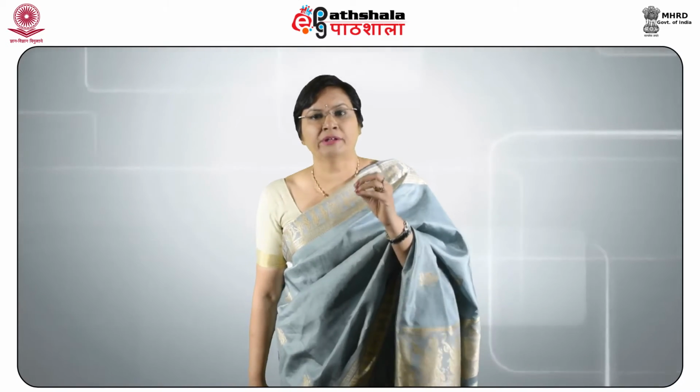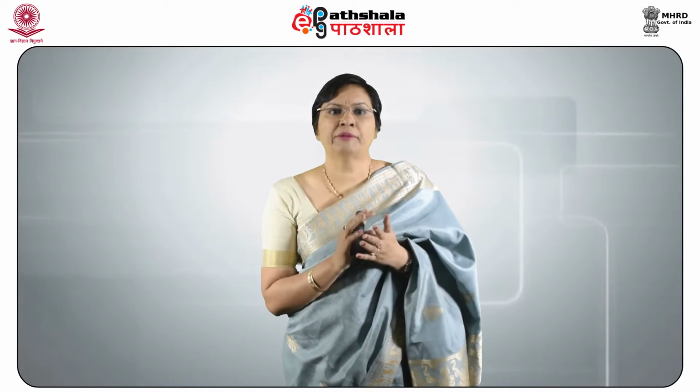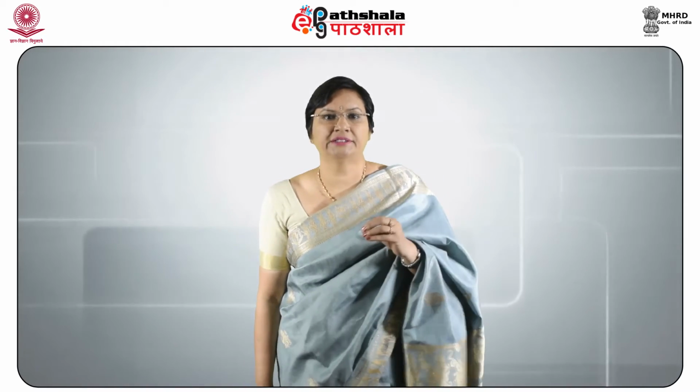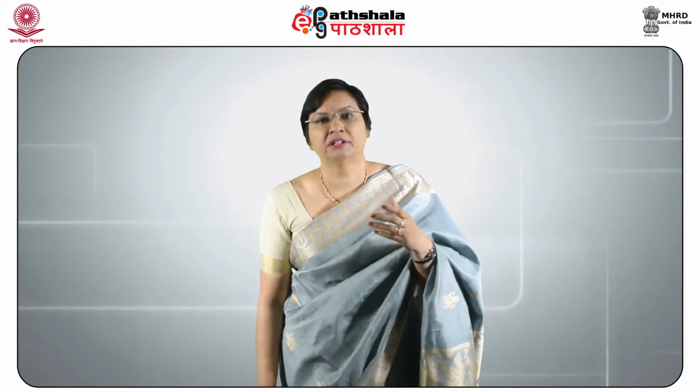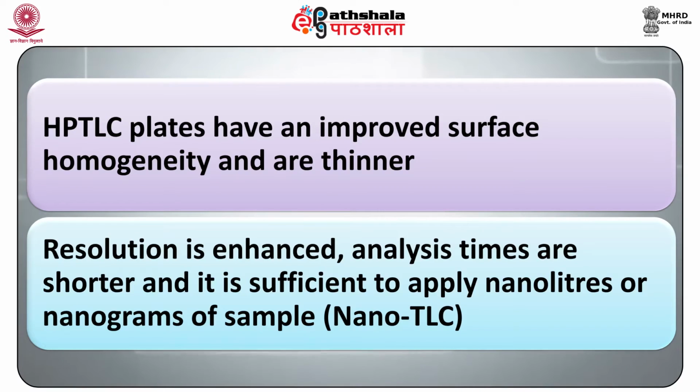HPTLC is an improvement of the technique where the sorbent material, for example silica gel 60, has a finer particle size and a narrower particle size distribution than conventional TLC. HPTLC plates have an improved surface homogeneity and are comparatively thinner. The resolution is enhanced and analysis times are shorter, and it is sufficient to apply nanoliters or nanograms of the sample. So this is sometimes also referred to as nano TLC.